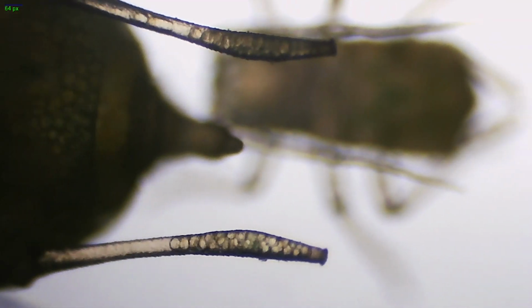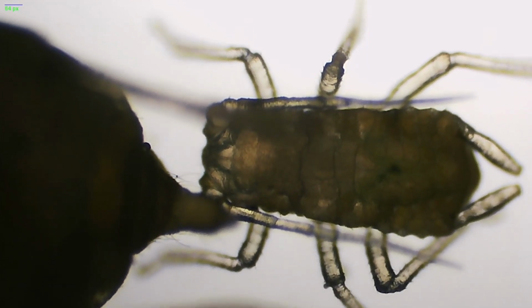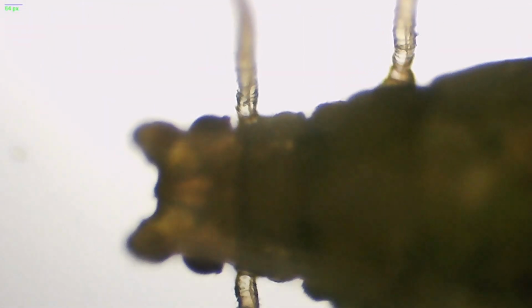So here we can see the pulse, and we're just going to be looking at the different body parts of this thing. Now this is a green aphid, and we will look at a brown aphid after we're done looking at this.